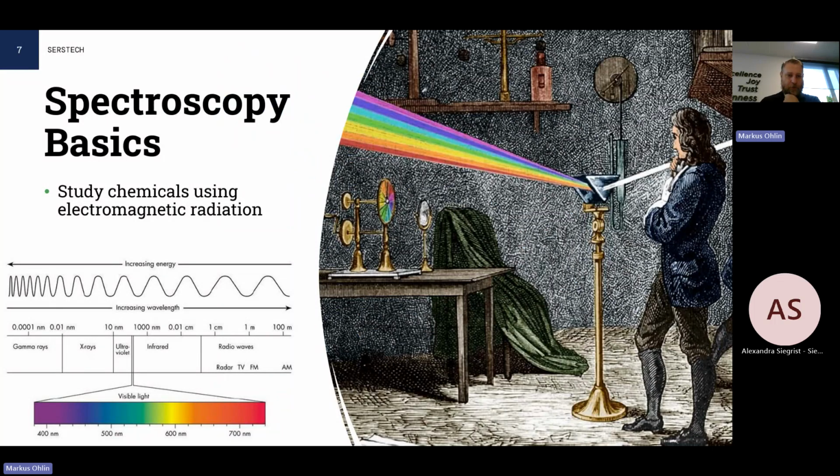And I just want to briefly go through a little bit what we mean with 785 nanometer. So that is the wavelength that we use for the light source. And in Raman spectroscopy, you use only one wavelength. So laser is the perfect light source in this case.